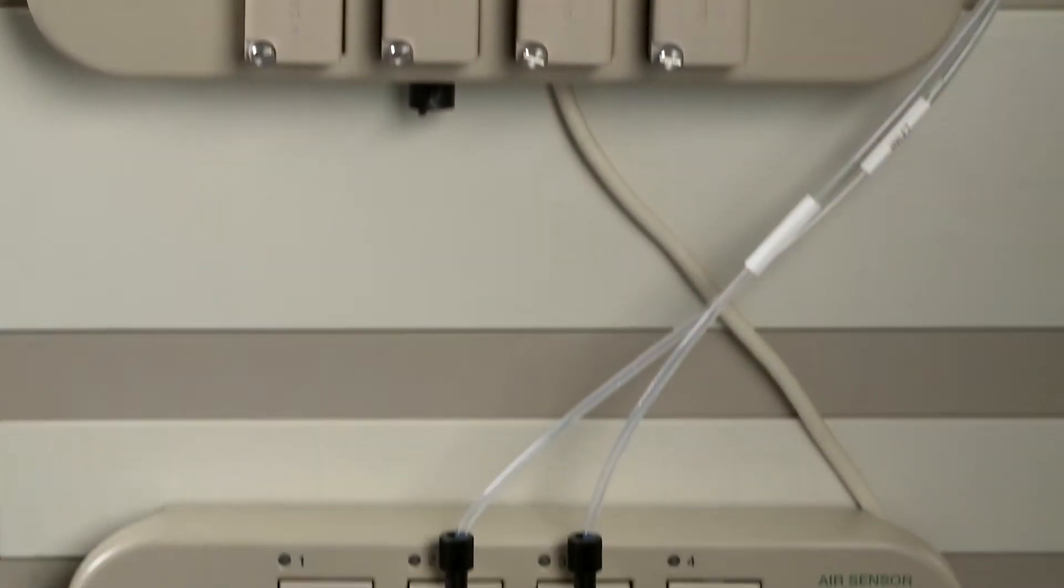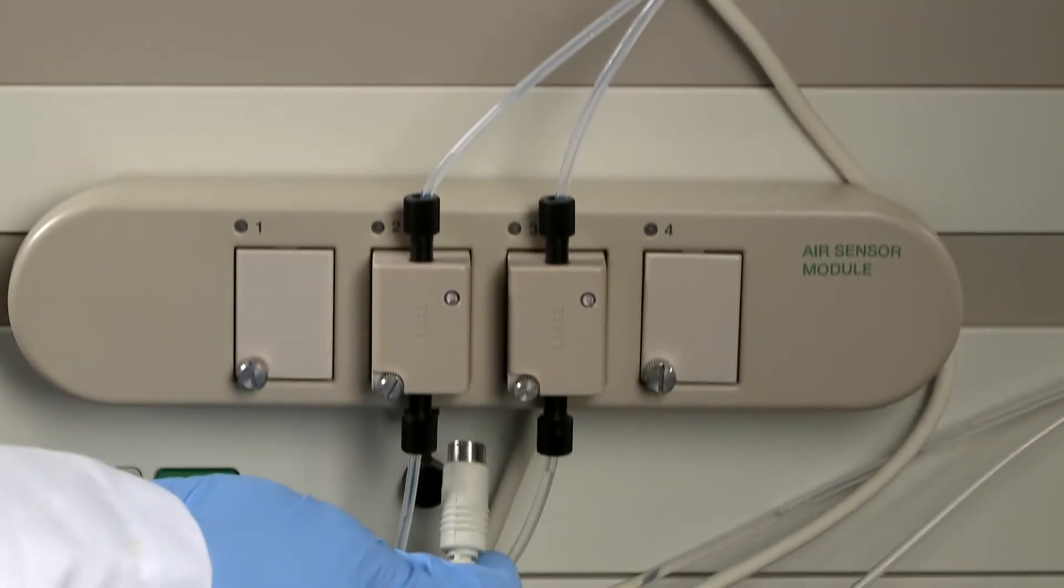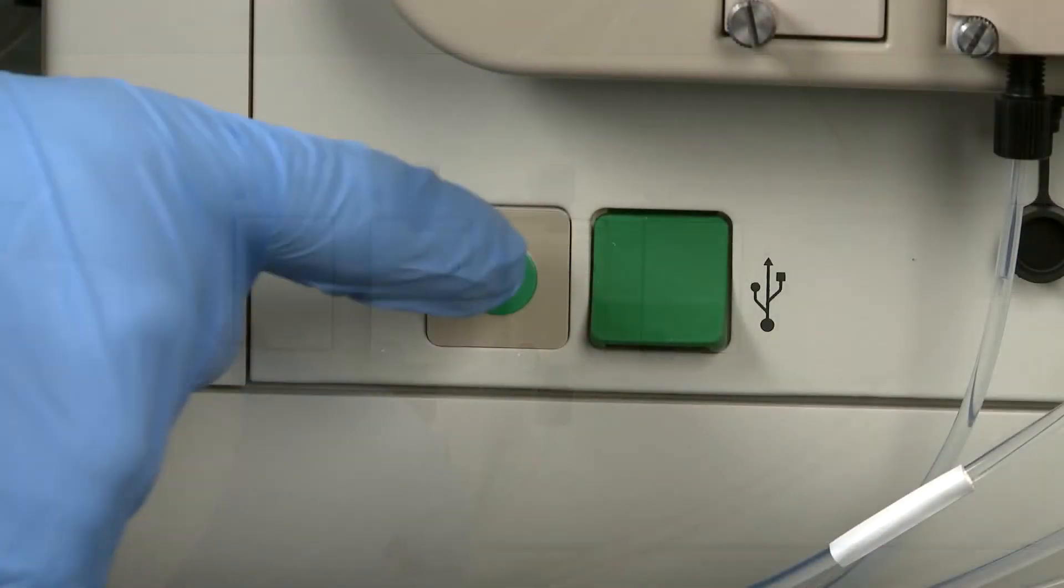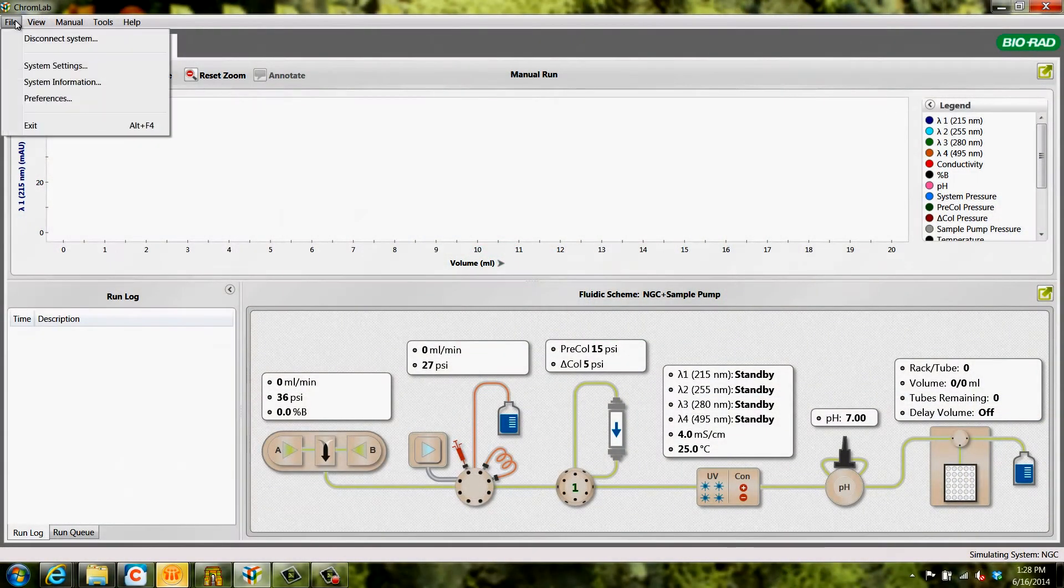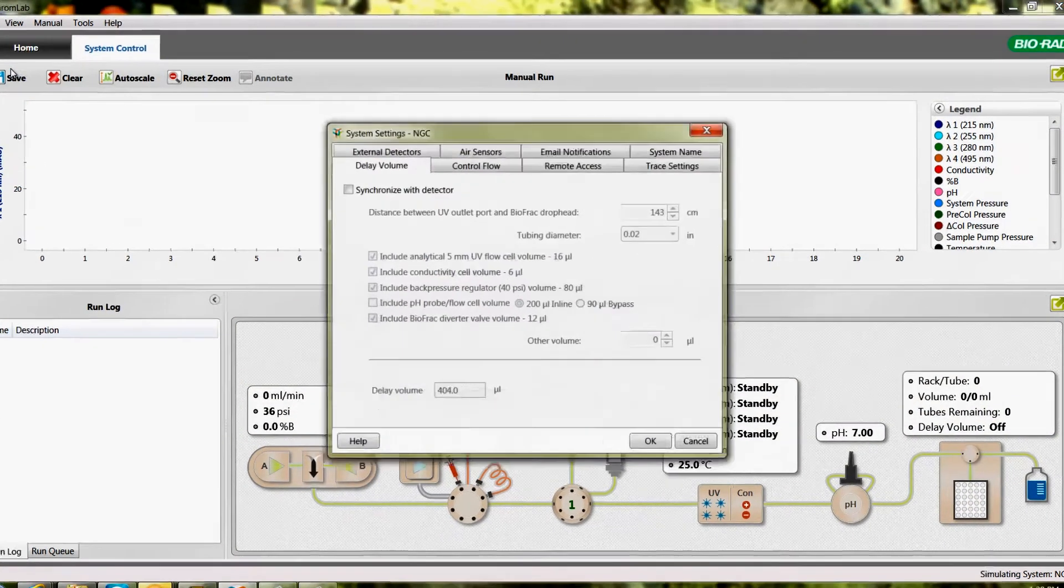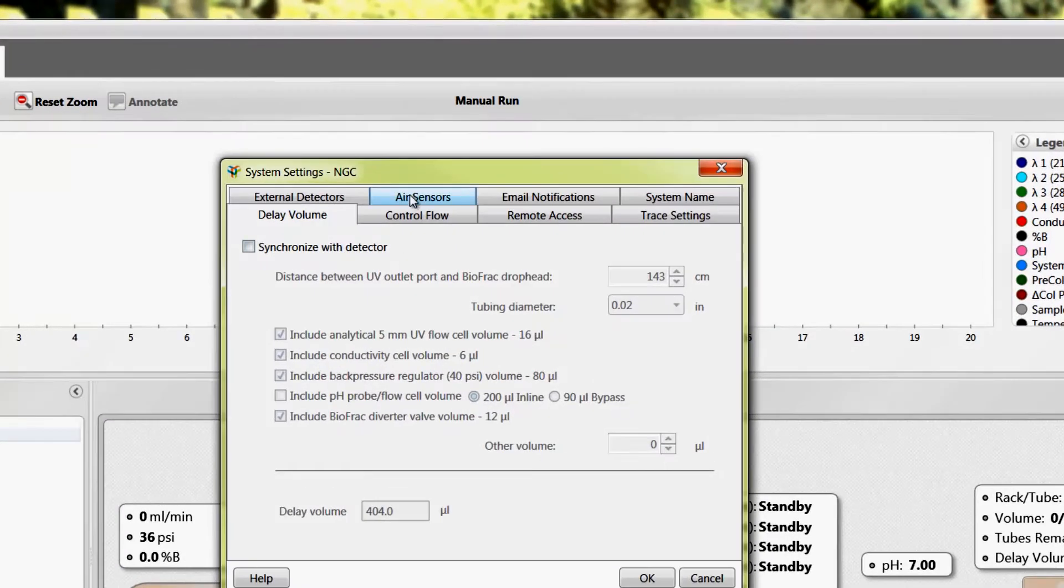Once the air sensor module is connected to the NGC and the air sensors are plumbed, the system can be powered on. Now, open ChromLab, enter the System Settings window, and click the Air Sensors tab.